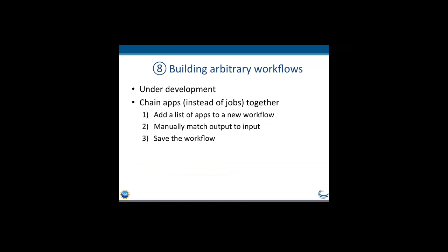The next feature we want to build is a different way to construct workflows — the arbitrary workflow method. Here, instead of running two jobs then chaining them, you add a list of apps to a new workflow and then manually match output to input. We can do some checking — for example, verifying this should be a FASTA file or a FASTQ file, to tell you if your match is not correct. Then you can save the workflow. We didn't do this initially because it's really safer to run each step, check your results, then chain them together.